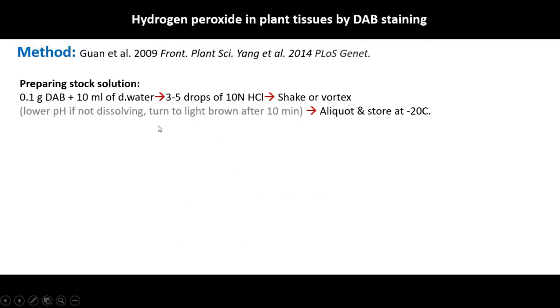This is a simple procedure. You can make a stock solution first using the DAB powder — about 0.1 gram dissolved in distilled water, then add a few drops of HCl because otherwise it won't dissolve. If it is not dissolving, lower the pH using HCl. This will turn into a light brown color solution after 10 minutes.